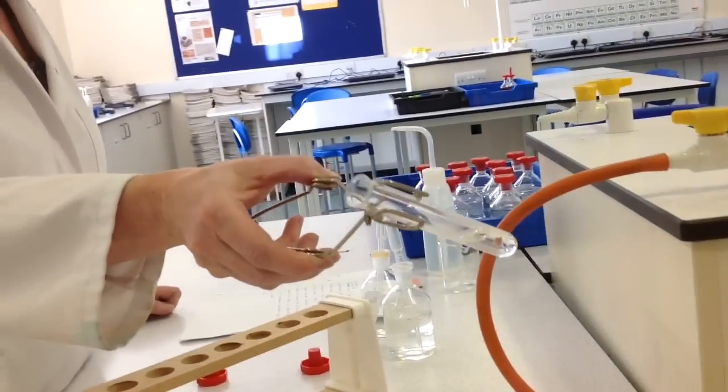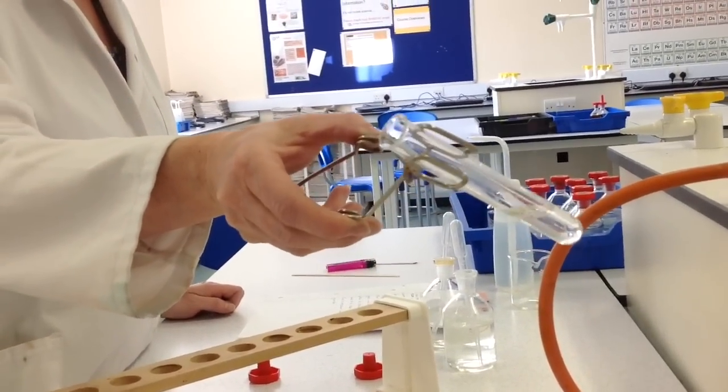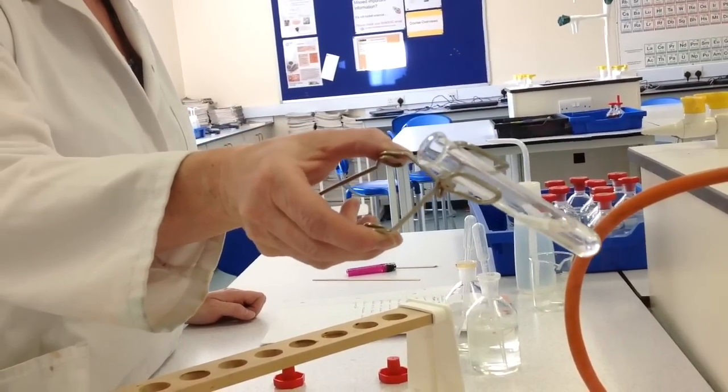Just waft it in and out. Make sure you're not pointing the end of the test tube at anyone, so that if it boils over, you're not going to hurt anybody.